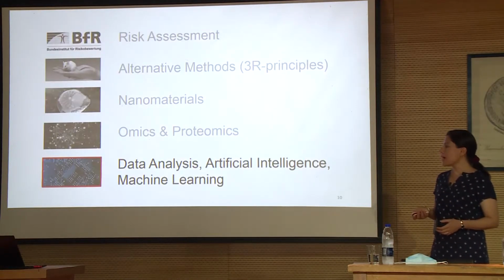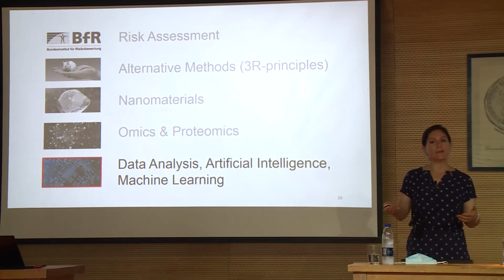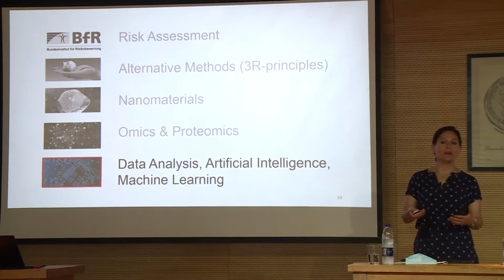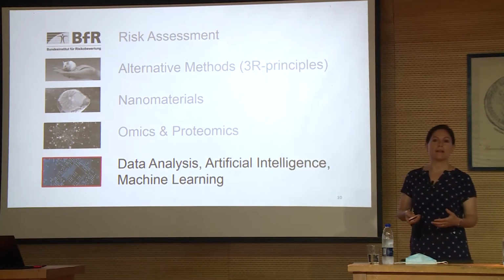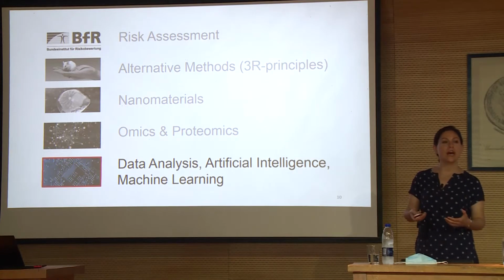For this, it's key to go into data analysis. This is a field for artificial intelligence and machine learning. If you have a bioinformatician in your group, you can only profit from that, from the data and from how to interpret it, how to read it, how to use it.